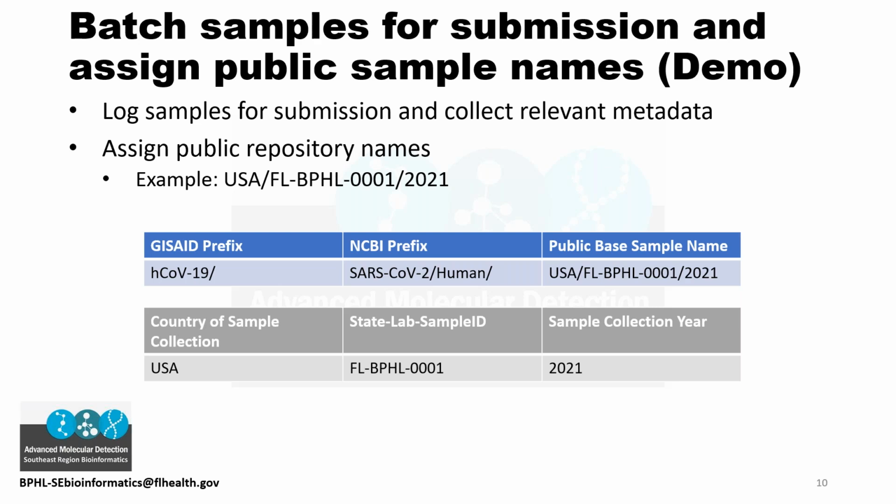But basically just make sure you have some kind of way to log all of your submissions, keep track of them, keep track of all of your sessions, keep track of all of your flag samples, etc. So I'll show you what we use here in Florida. You're welcome to use it, and I'll be providing that, and it will be up on GitHub too.